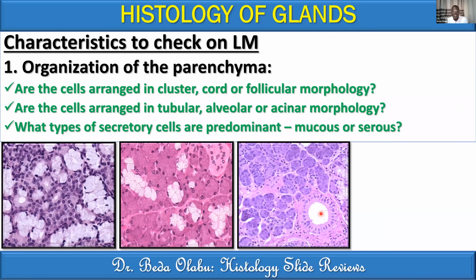That's not a secretory portion. You can't have just a single isolated secretory portion like that one. I'm saying that because I've seen someone writing alveolar morphology. A few people have still written acinar morphology. I think you got lost from somewhere. I hope you'll recover yourself. It cannot be a capillary, as some people have written. Remember, capillaries are lined by simple squamous epithelium. They're not lined by simple cuboidal epithelium.